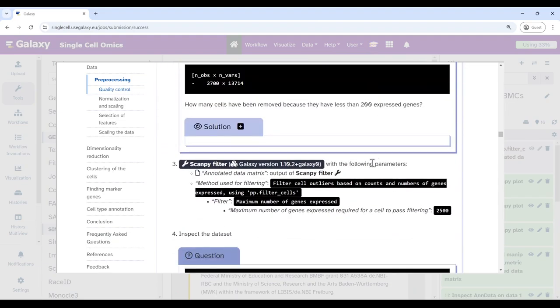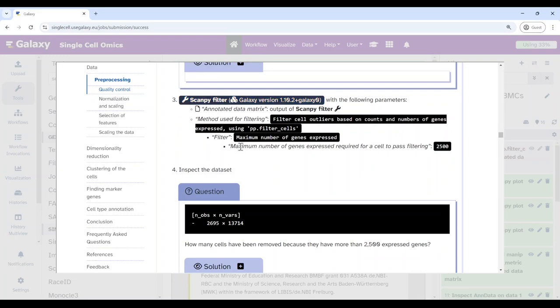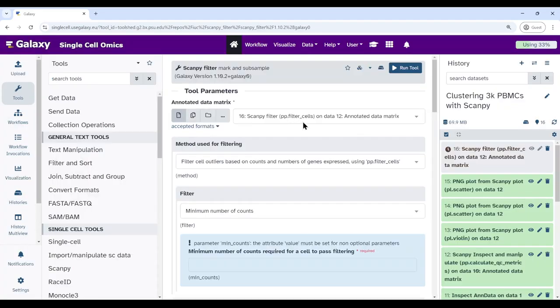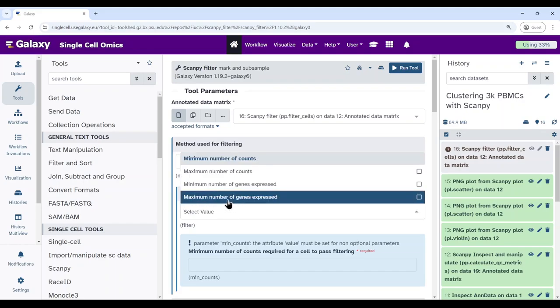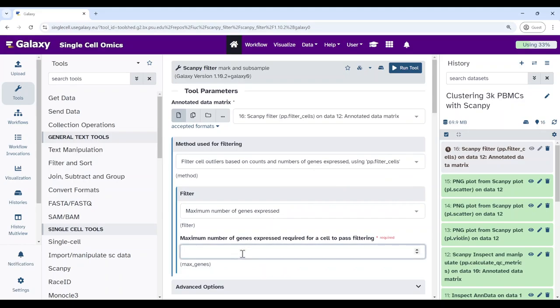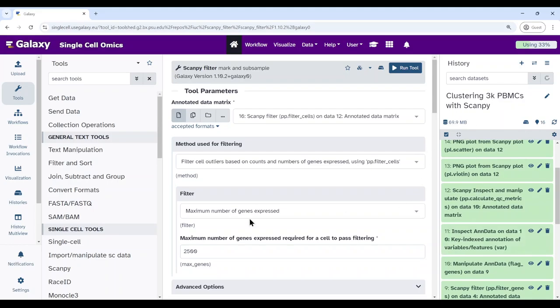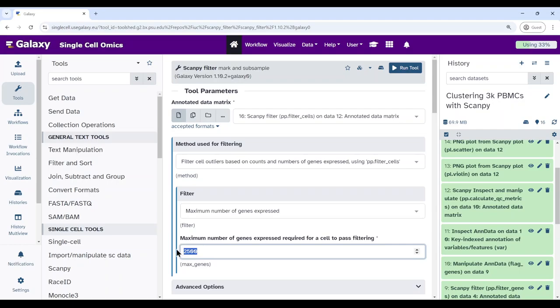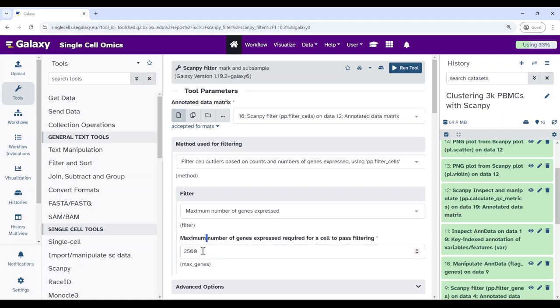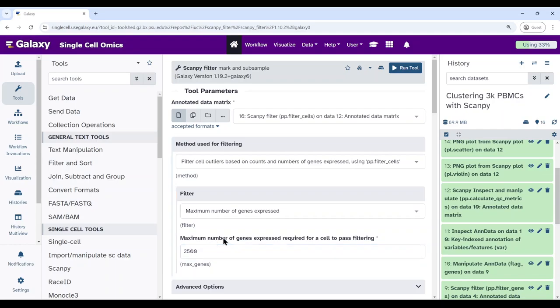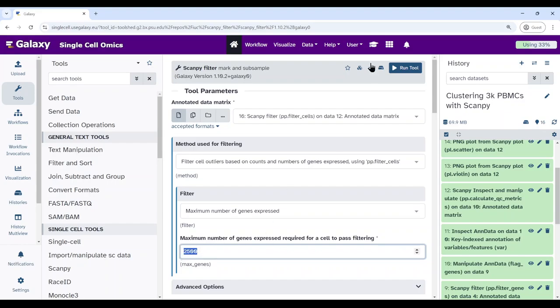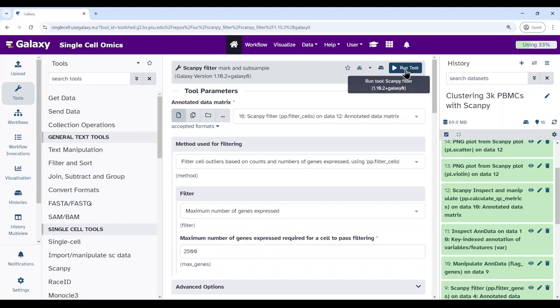Subsequently run another filter with a maximum number of genes expressed set to 2,500. Make sure you're using the previous step's output. This cutoff tries to omit cells which don't fit into the distribution of remaining cells — this also indicates potential doublets, where a droplet contains more than one cell. We throw these away because they are also highly expressed, which is abnormal.